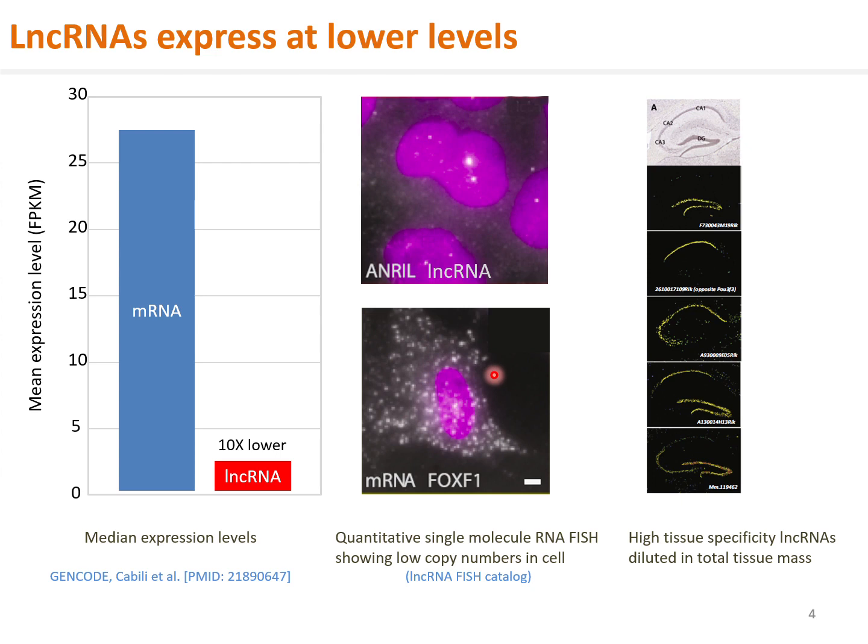The other reason LncRNA appears to be low in abundance is that LncRNAs can be highly specific and restricted for particular cell types. For example, individual hippocampal LncRNAs are expressed in particular subregions and layers in CA1, CA2, CA3, and dentate gyrus. Even if these LncRNAs are expressed at high levels in the corresponding cell types, they can become diluted in the total RNAs extracted from the entire piece of tissue.